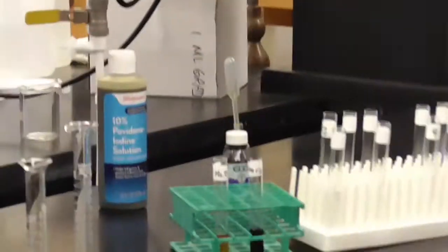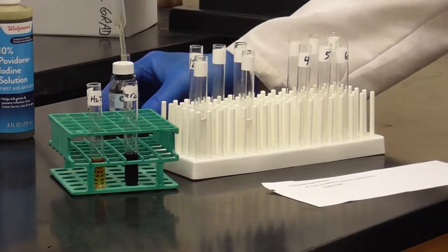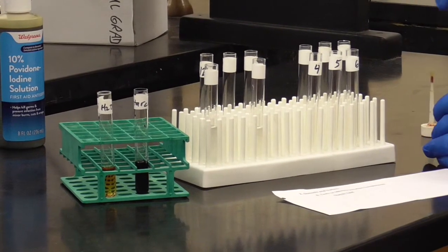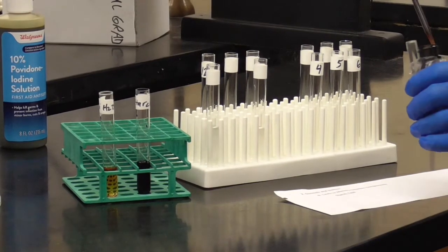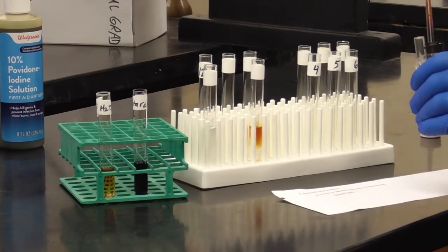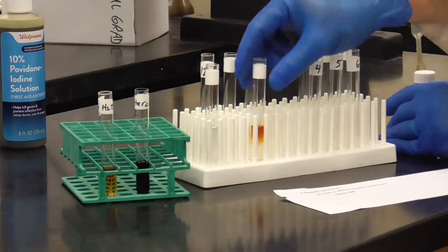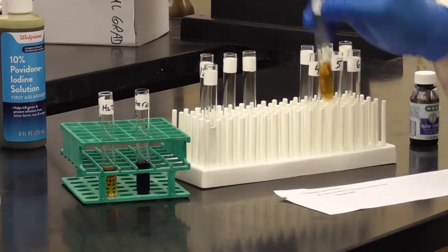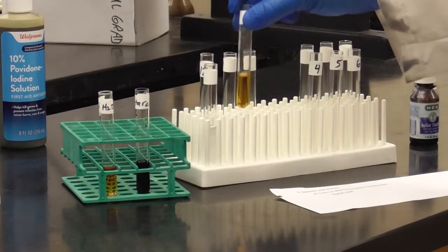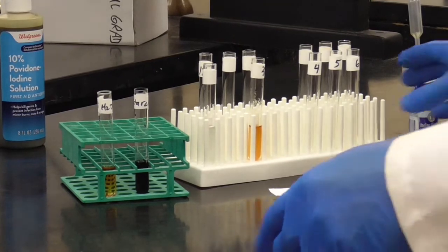So we're here, the starch test. Remember, that was our negative, and that's what our positive looks like. All we do is add a couple drops of the iodine to it. So we'll do that here in test tube number 3. 1, 2, 3. Mix that up. And clearly negative for starch.